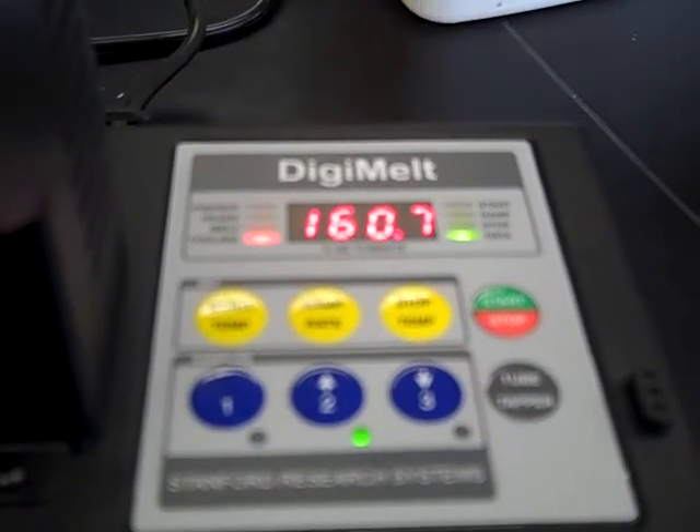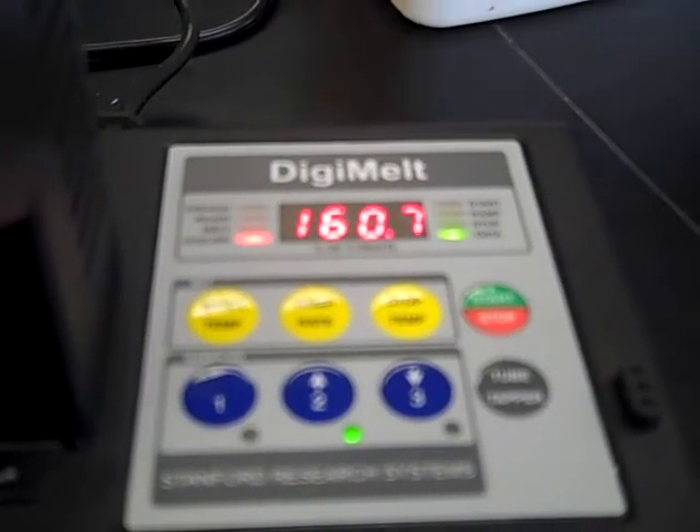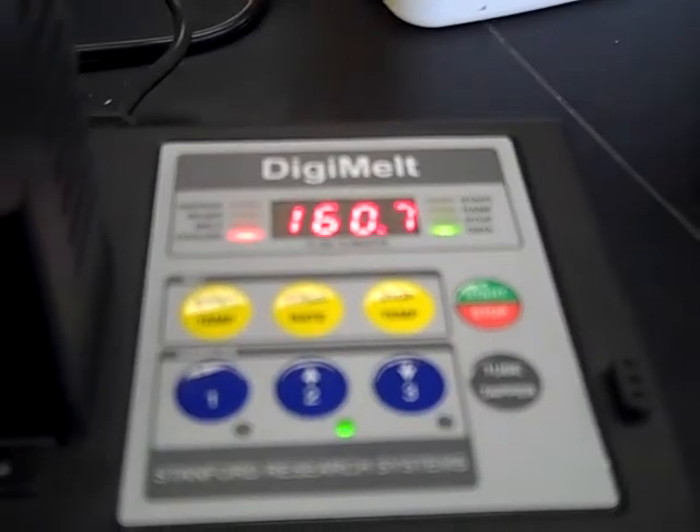I can now go back and analyze based on the literature value — which for my case was 159 — why that range might be broad, and if it's low, why it might be low. That gives me some idea not only of the identity but the purity of my product as well. Remember, melting point is just a physical property — it's a rough way to determine the identity and purity of an organic compound. Later on we'll learn much more sophisticated techniques, but for this lab it's a quick and easy way to assess identity and purity.